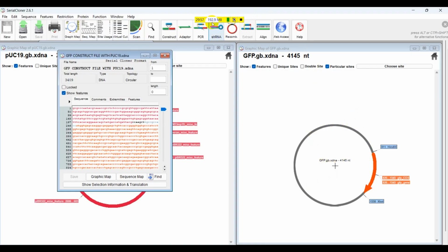Some more information is that lac operon is induced by IPTG. So if we give IPTG in the culture media, then lac operon will show more gene expression and GFP will glow with more intensity. Thus, we can conclude that our gene is expressing well, which is a good sign.